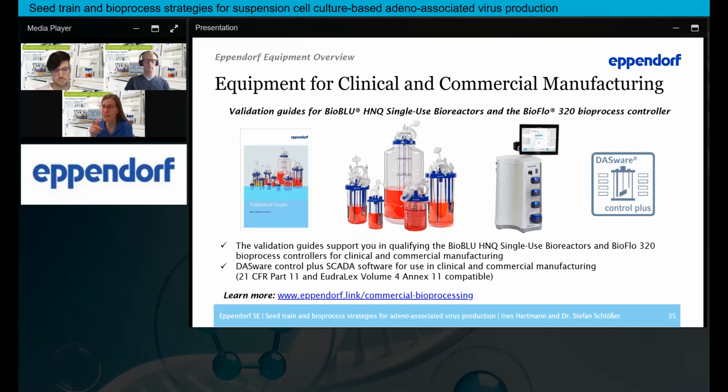But on the other hand, in this study, we used baffled flasks, and we have also good experience with these. So I think, especially in AAV production, both, of course, vented non-baffled and baffled are used. So I would start with non-baffled and just try.